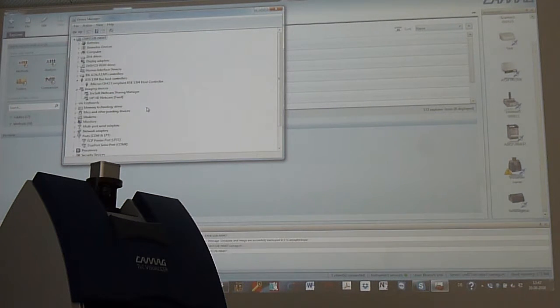As I know my computer quite well now, I see that the problem is I just have one IEEE control. I have a small IEEE on the backside there, but it's a 4-port which is not working, because we need a 6-port with power for the camera.